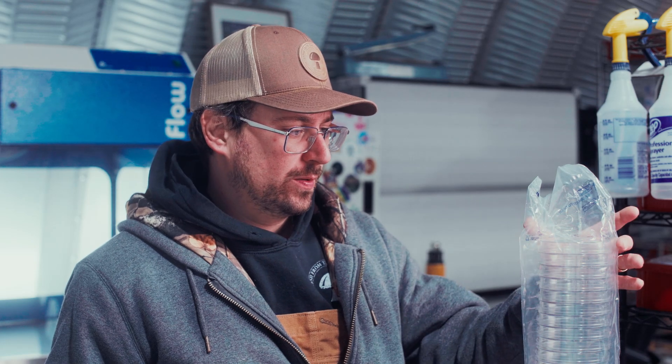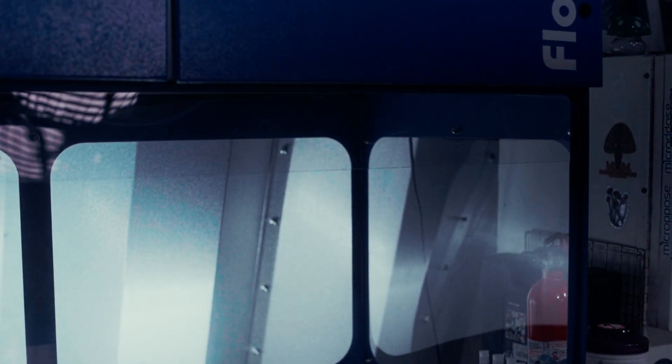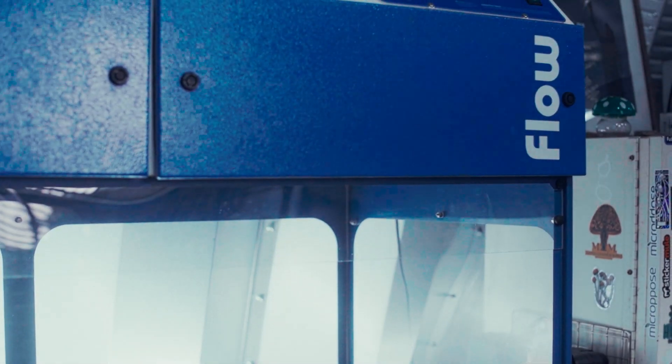One of the major cons of using plastic dishes is that you're going to need a flow hood. Because they come pre-sterilized, you have to sterilize your agar and then pour in a sterile environment, as opposed to the glass dishes, which I'll talk about in a minute.